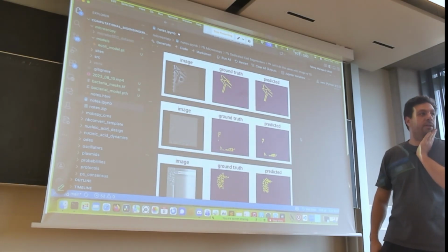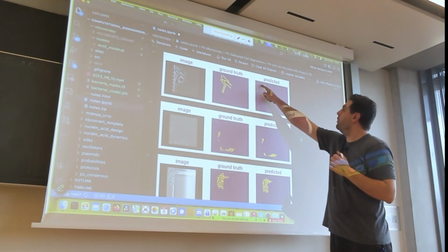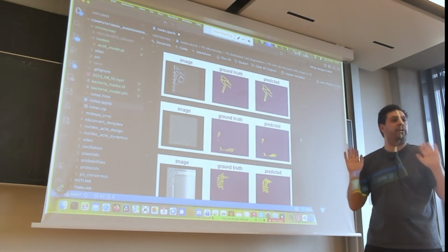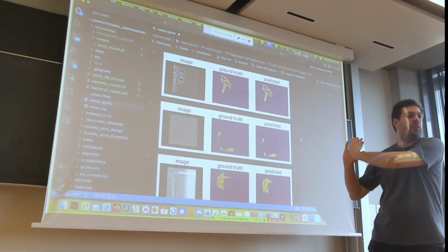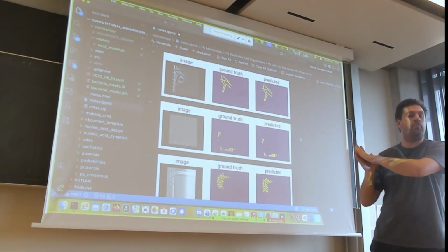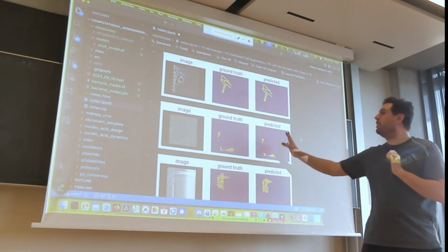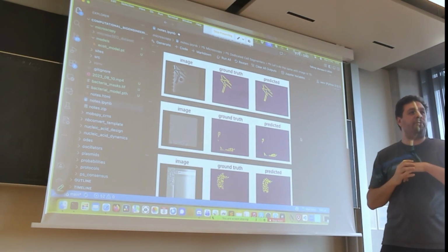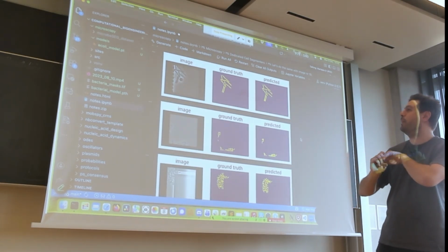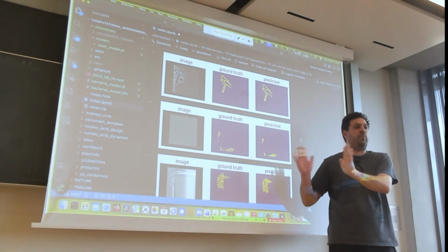That looks pretty good actually. It's a bit fuzzy here and there, and there are some pixels that are missing, but otherwise it's pretty good. This is only 25 minutes, and it can be much more improved, of course. But just for running it on a laptop, it's pretty good. And this has never seen any kind of cells probably. It was probably trained on something that can be used on cats and dogs and whatever. So it's a very standard thing. It has nothing to do with microbiology.